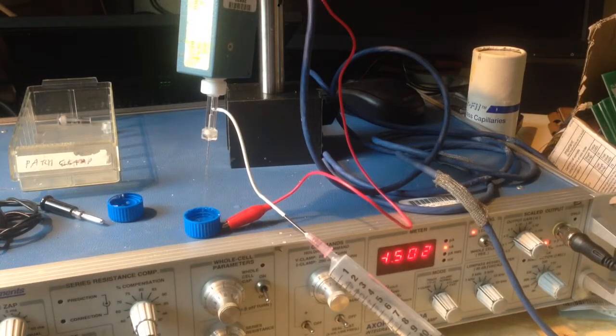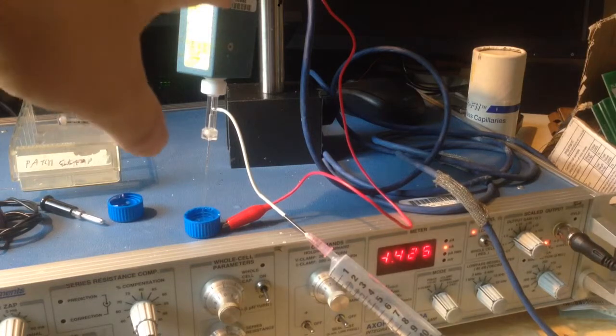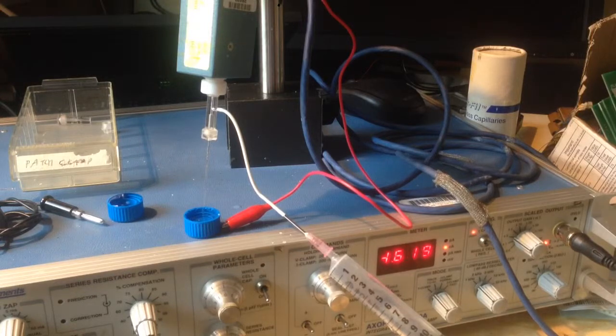So basically, we have a solution here, which is the ionic buffer solution, which is KCl, and it's about 100 millimolar, I think. I diluted it to something like that, and then I have this Axopatch 200A. This is an older model, the model before the 200B. I picked it up on eBay, and I picked up the unit and the head stage separately. I don't think it's particularly well calibrated. There should be a calibration procedure to match the head stage to the unit, and I did some basic calibration using 100 meg and giga ohm resistors, but I don't think it's particularly well calibrated. So there's lots of issues, I'm sure.